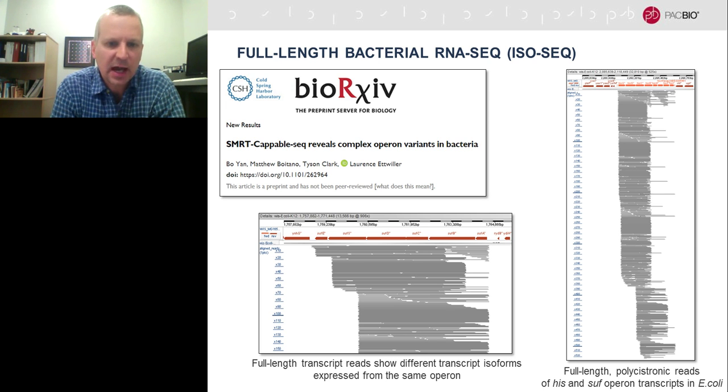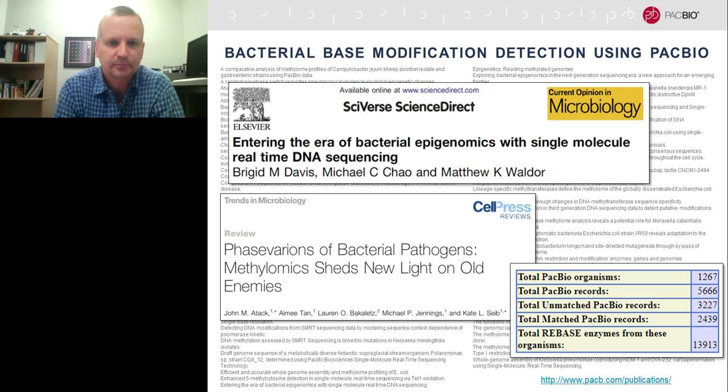And in the paper, there are some examples that show that this is being regulated by the bacterium. All of this type of information is much more difficult to attain with short-read sequencing. And so it's really, for the first time, a detailed and unprecedented view on the complexity of the bacterial transcriptome, bacterial gene expression that was previously hidden before the ability of using this method.